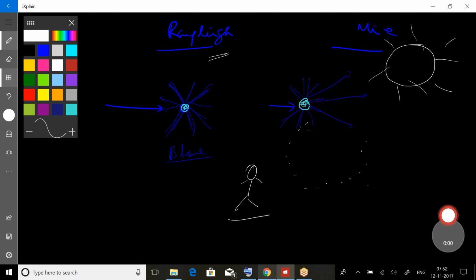So when this person is looking at the sun, there are particles in the atmosphere, and the particles displaying the Mie scatter would scatter the light in the forward angle. With Mie scatter, the higher scattering is seen in the forward angle. And since the forward scatter is a property of these large particles, they can scatter all wavelengths of light. That's why we see a white region around the sun.